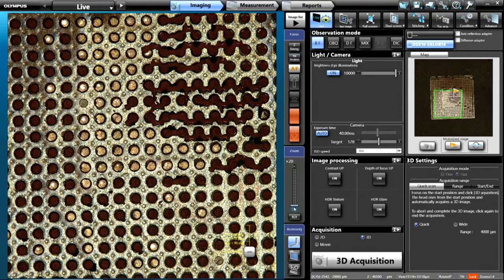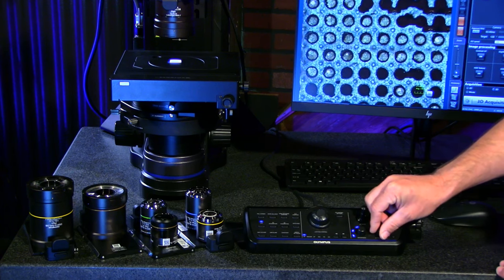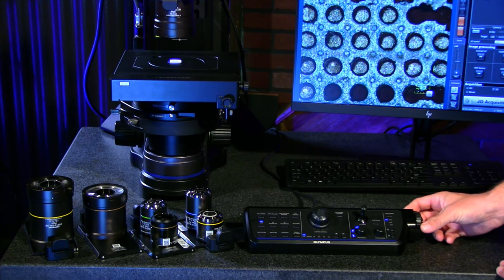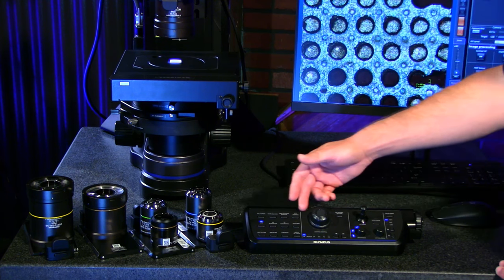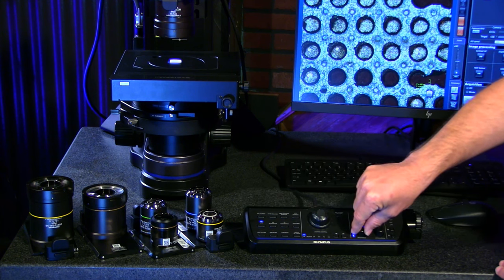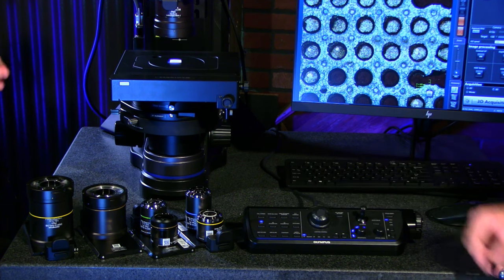Being a digital microscope, it's built in with optical zoom capabilities in the software as well. As I slide this slider up, or with the mouse, I can do all these same features on the hand switch. On the hand switch here, I just turn an optical zoom button and I can zoom in and change focus. I can move around with the XY stage control. It's all very convenient on the hand switch. Lighting control — you turn intensities up and down. It makes it really easy to just quickly adjust. Throw a sample on, move around, quickly adjust.